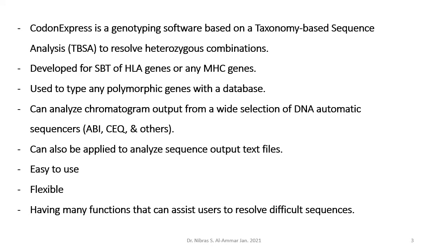Also, it can analyze chromatogram output from a wide selection of DNA automatic sequencers like ABI, CEQ, and others. It can also be applied to analyze sequence output text files. It's easy to use, flexible, having many functions that can assist the user to resolve difficult sequences.